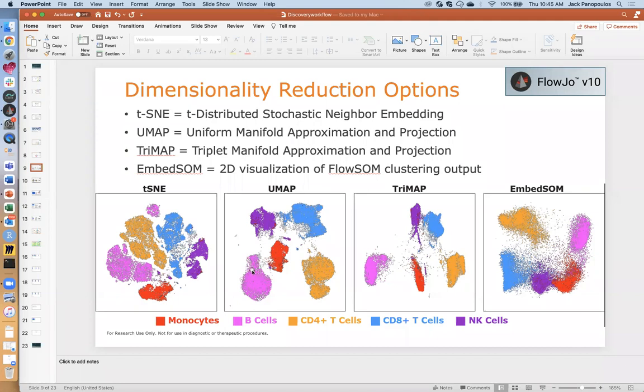There's this little peninsula here, and then there's this globular cluster down below. My immediate assumption is, okay, one population here, maybe another population here. Now, if I look at t-SNE though, t-SNE tends to break things up in a more refined way, and I prefer it for that purpose because it reveals the nitty-gritty phenotypic details between populations, maybe sometimes too much.